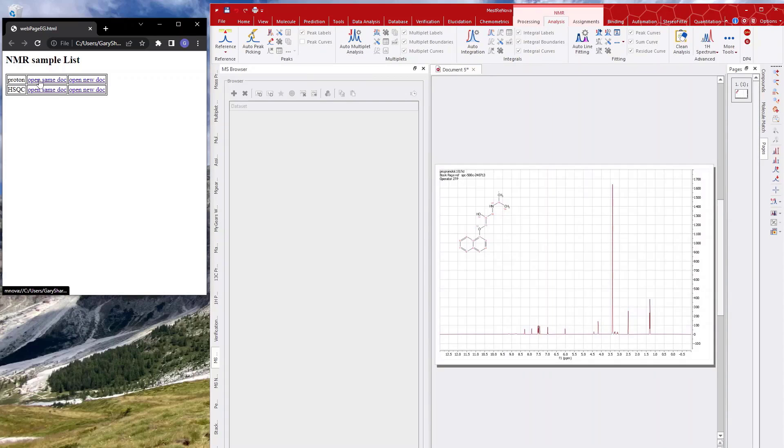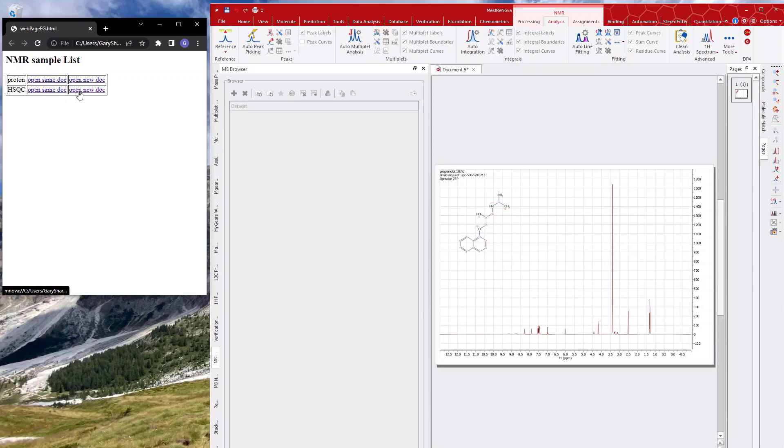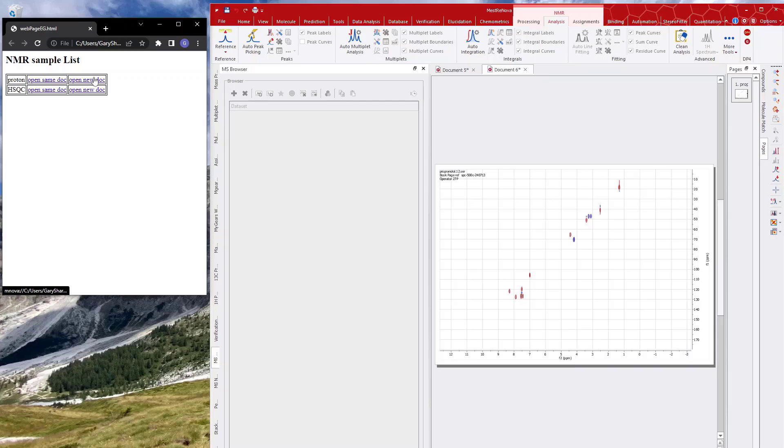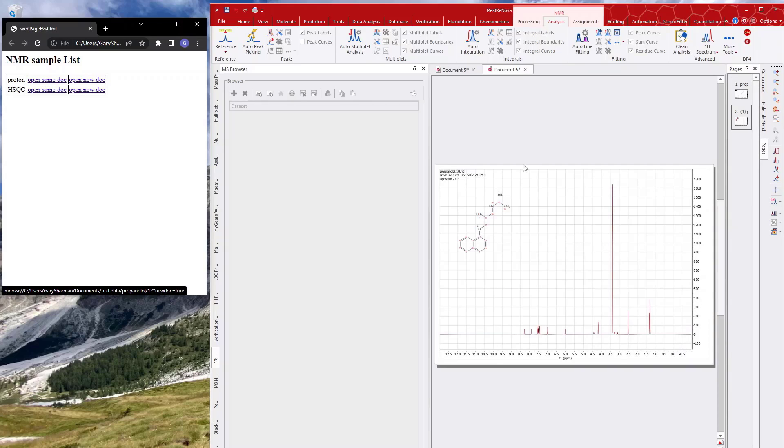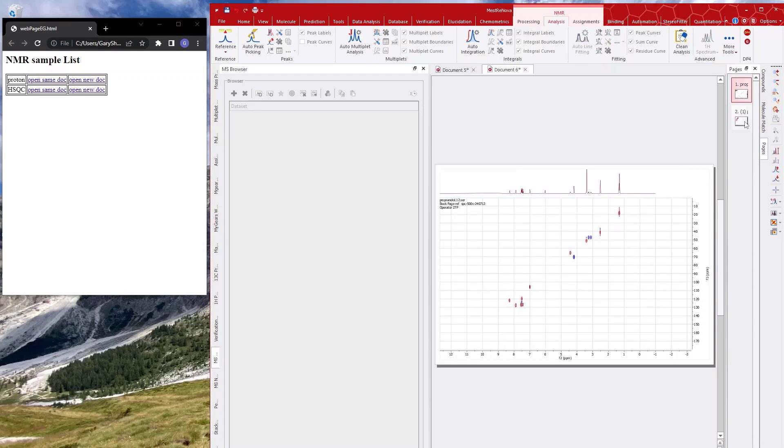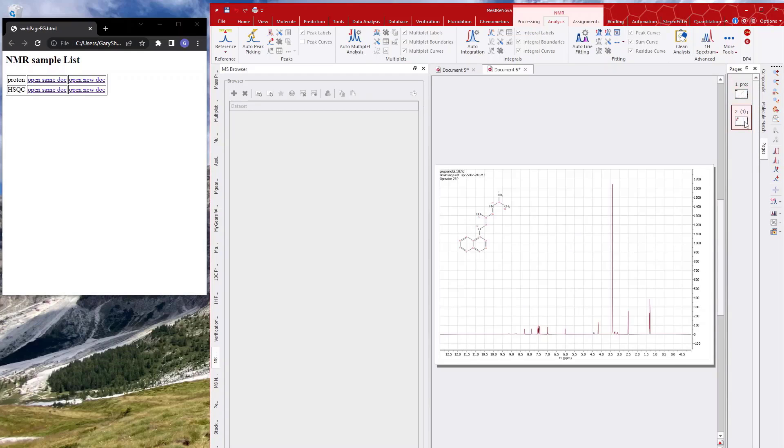I can open an HSQC into a different document, so you'll see that's opened a second document up here in Mnova. Or I can maybe open the Proton into this same document by clicking on this link, and you'll see now I have two pages in this document with a Proton and HSQC.